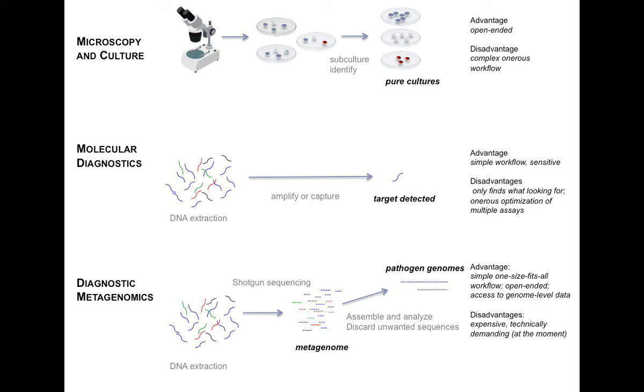So what does that involve? Well, basically, it means that you just extract the DNA from your sample en masse, all the DNA molecules in there. Together, they are then sequenced, and you get a metagenome. So a metagenome is just a collection of individual genomes joined together, jumbled up, if you like. It's a bit like taking several different jigsaw puzzles that you might have at home and just taking all the pieces and mixing them all together into one big jigsaw puzzle.